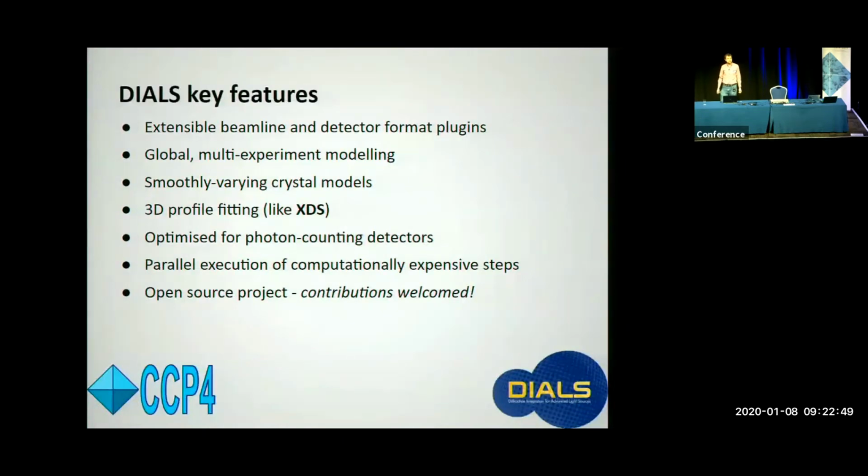We do global multi-experiment modeling with smoothly varying crystal models, which is an innovation in DIALS. It's a 3D profile fitting program using the same algorithms as XDS. DIALS is optimized for photon counting detectors of the sort that you find at synchrotrons like Diamond Light Source, although we are doing much better these days with CCD detectors than we used to.